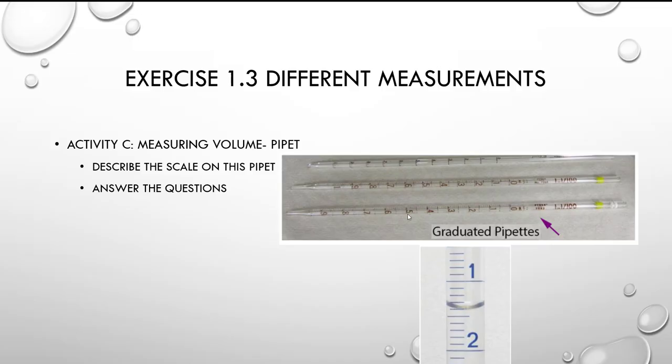Okay, so that's a little different in measuring things. Then you can describe the pipette, figure out what it's measuring and so forth, and then answer the questions.